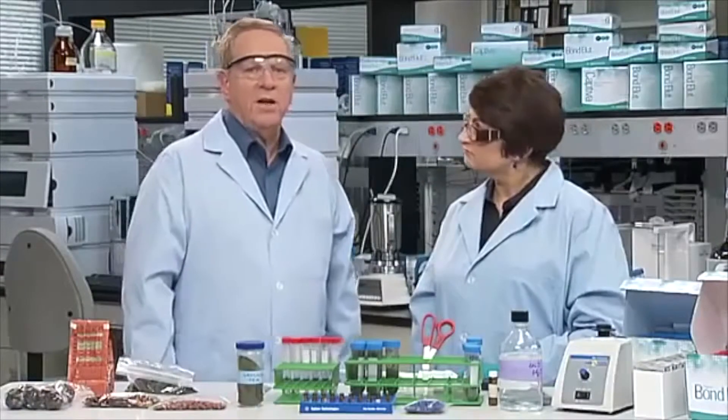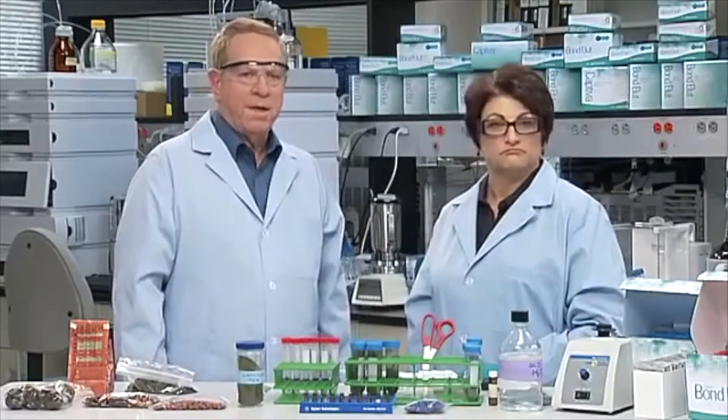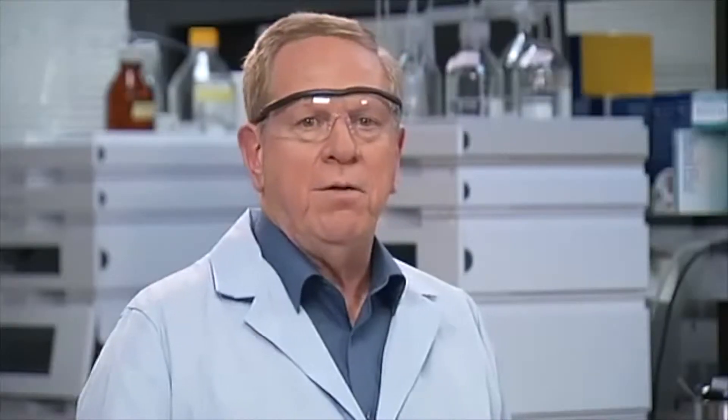For acetonitrile salting out or partitioning to occur, we must have a percentage of water associated with the sample. To provide the required environment, we will add water to the dry sample in order to create the required aqueous environment within the sample. Let's take a look at an example of a dry sample. In this case, we'll use tea leaves. In general, you will weigh a portion of the amount stated in the QuEChERS methodology.